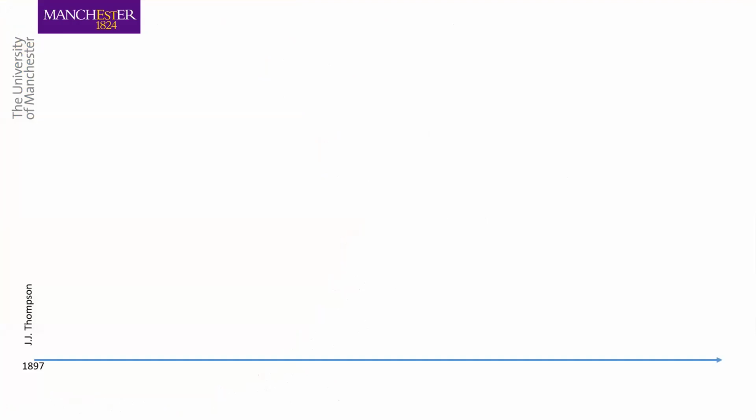Just to give a background, I was talking to Jack about this, and he thought it would be nice to have a bit of a history of EBSD, and I agree with it. So I've prepared a few slides for that. Of course, this all started with J.J. Thomson discovering the electron in 1897, and then his son realized diffraction of electrons.